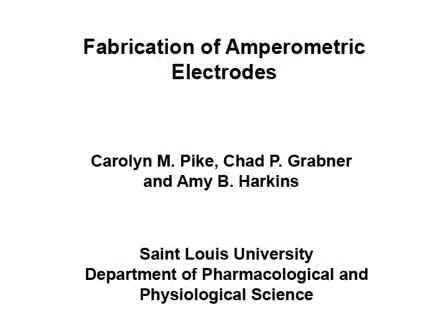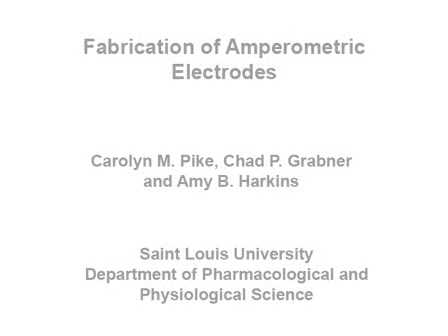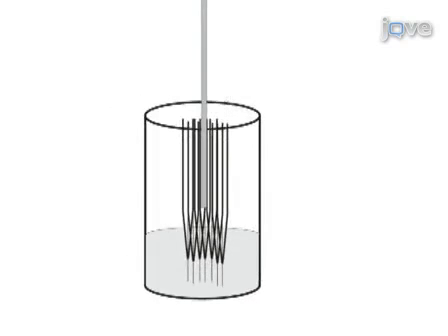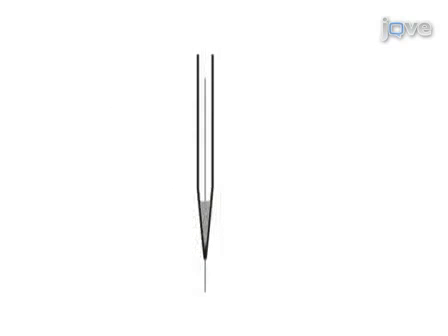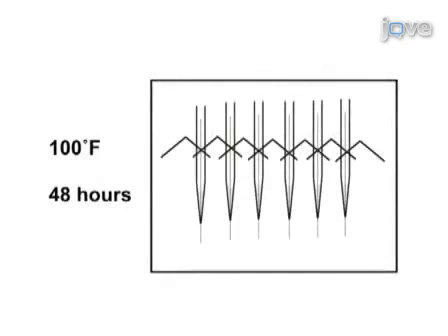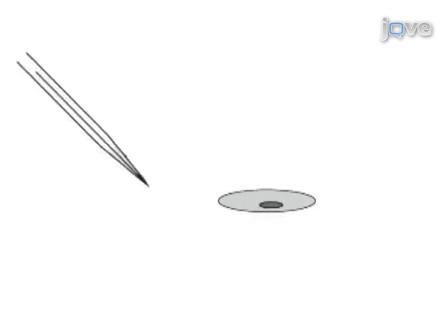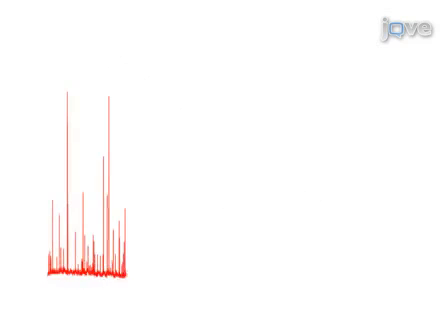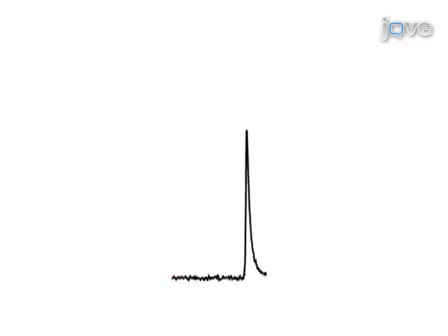This protocol describes how to generate carbon fiber electrodes. First, we'll fill the glass capillaries with carbon fibers that have had their sizing removed. Next, we'll pull the fiber-capillary assembly into two electrodes and cut the fiber. Then we'll arrange the electrodes to dip into epoxy to seal the fiber into the electrode, and store the fiber electrodes on a rack in a hot oven. These electrodes are used to detect catecholamine release from vesicles in single cells with carbon fiber amperometry. Successful recordings show low noise and well-distinguished upward spikes on the recording trace.